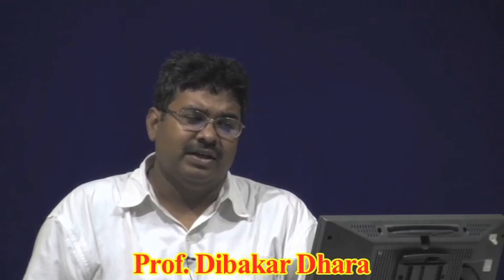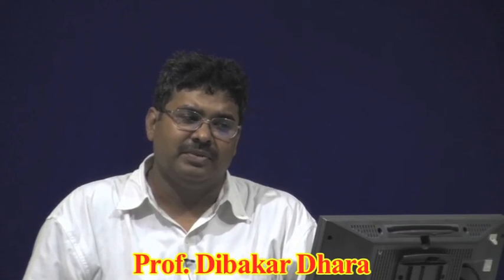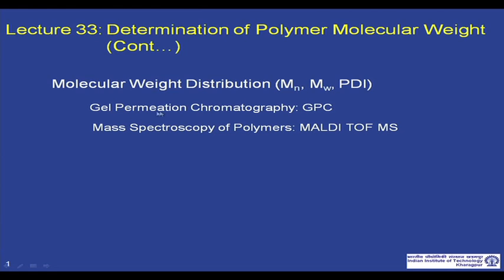Welcome back to this course on polymer chemistry. In today's lecture, we will continue our discussion, which we started, on determination of polymer molecular weight. Today we will continue our discussion on gel permeation chromatography or size exclusion chromatography, and then briefly discuss mass spectroscopy of polymers, in particular MALDI-TOF MS.